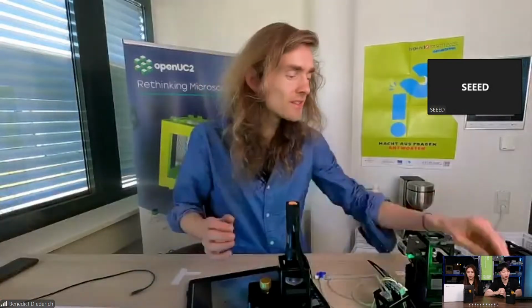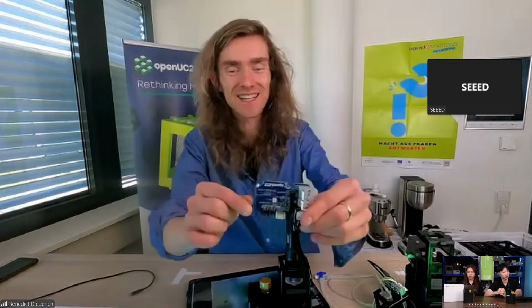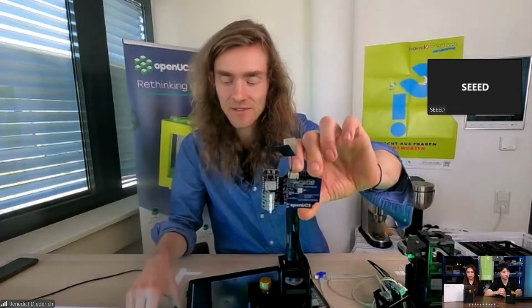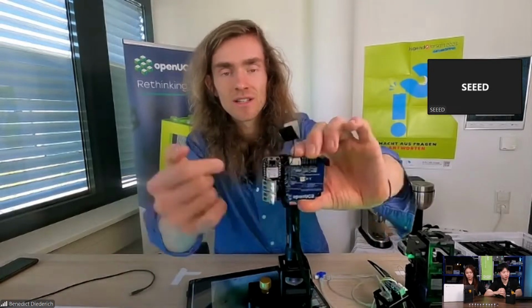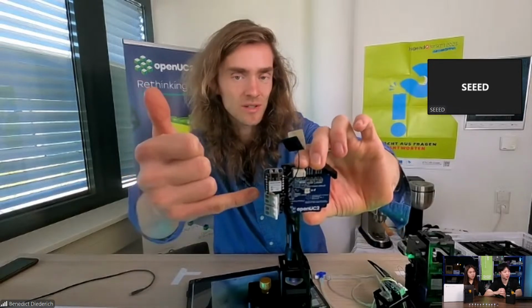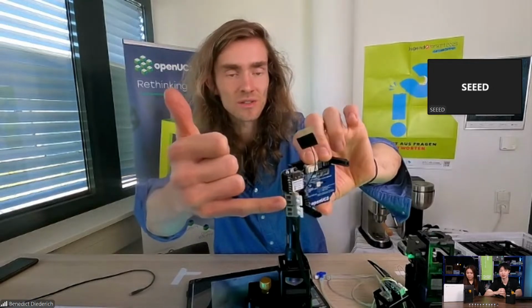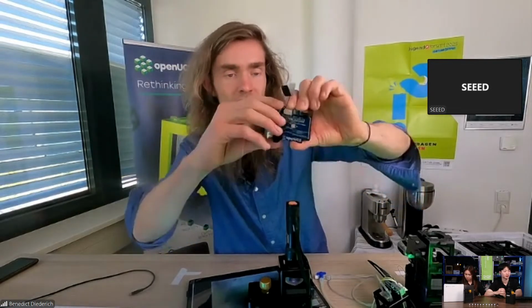And for this, Christian, our very talented electronics guru, designed this little PCB. And you already get the idea. It's again fitting in this little cube here. It's powered by a little Xiao. So you see this PCB right here, and this is controlling arbitrary components. For example, you have two ports for motors or stepper motors, servos, you have an LED, and this directly fits on this microscope here.